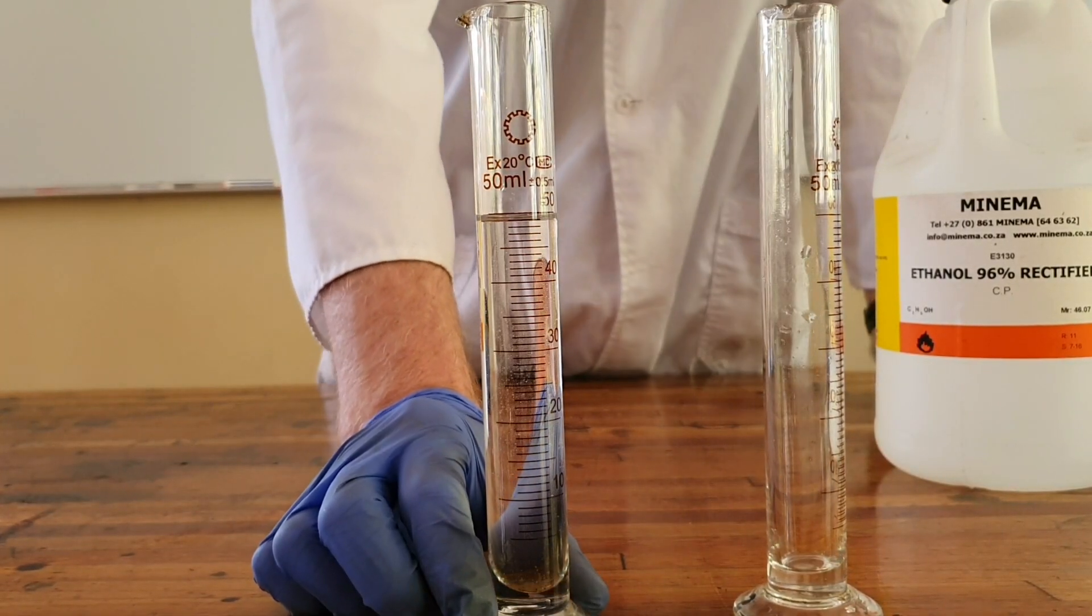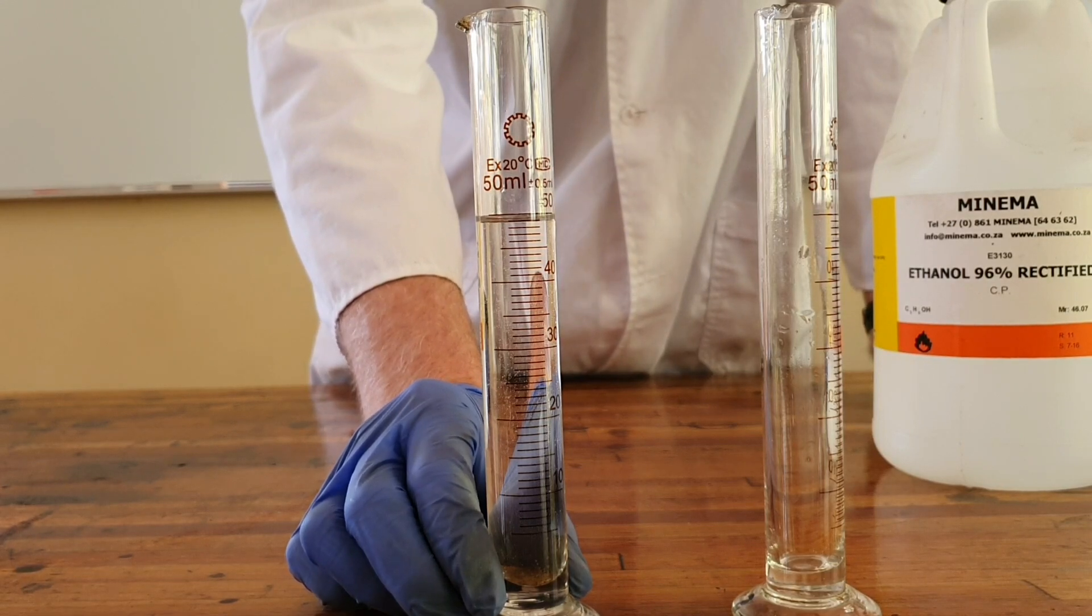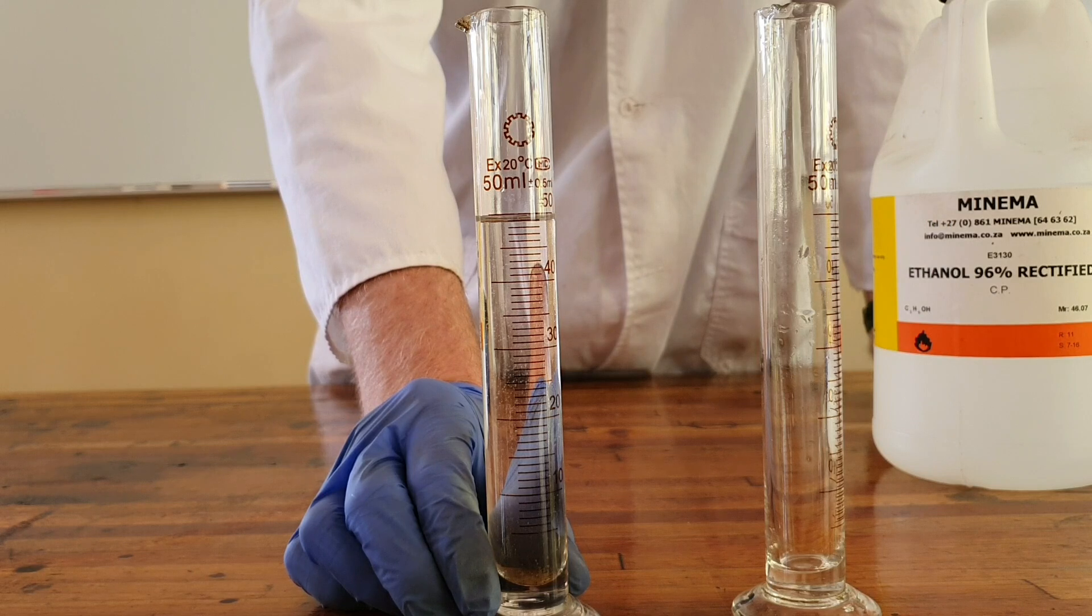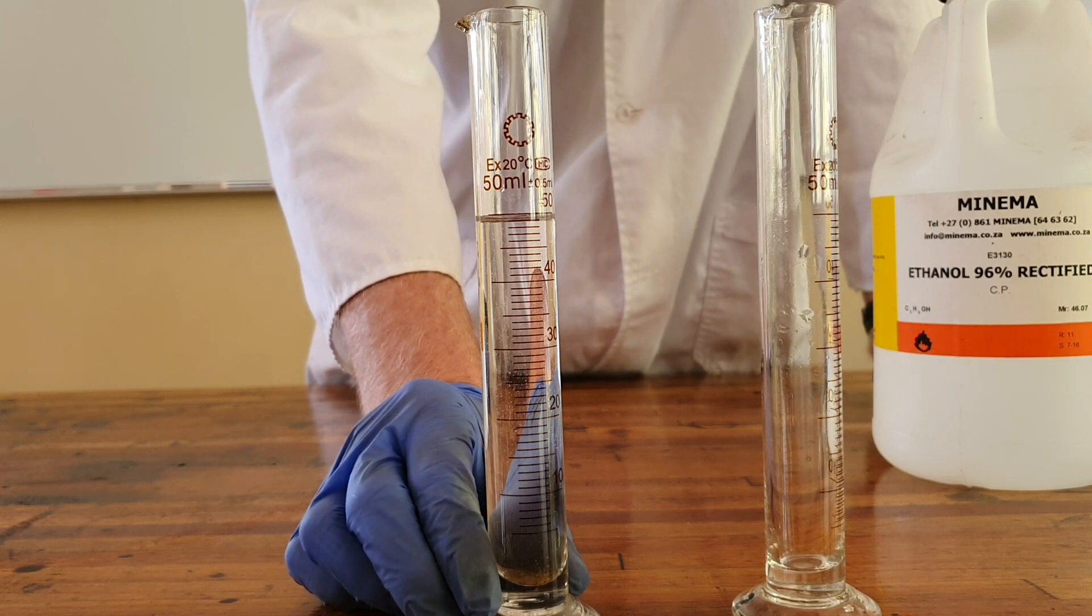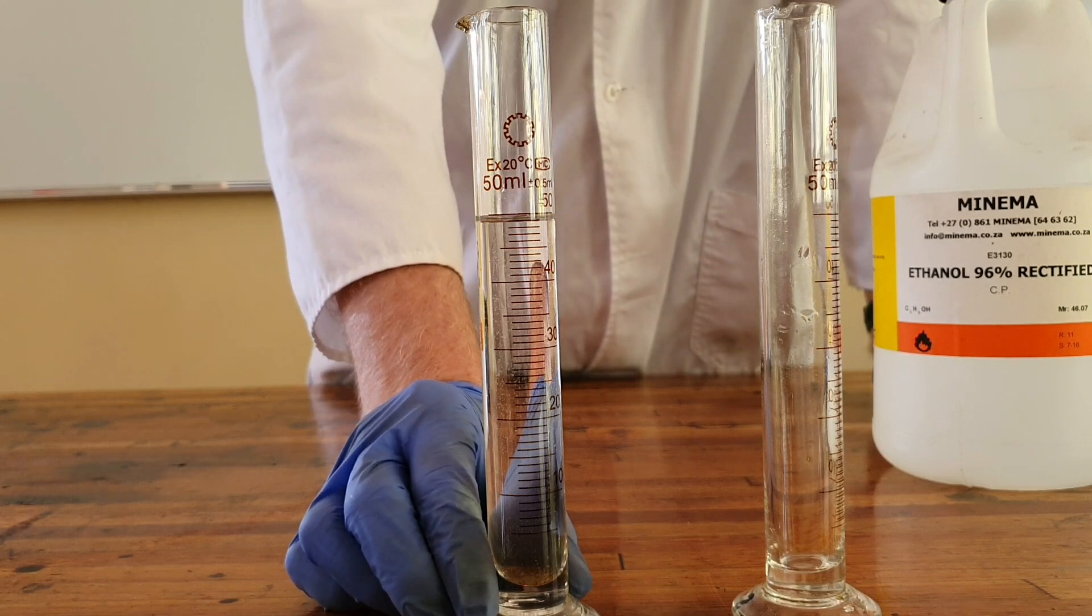As we can see here, the bottom of this meniscus now aligns with 49 milliliters and this shows us that some of the water molecules are able to fit in between the ethanol molecules, which means that they essentially occupy the same space.